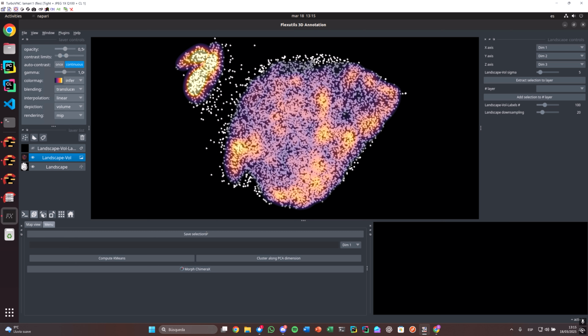Being the first one, the Save Selections button. As you will be seeing later on, by clicking on this button, we can save what we have been doing up to that point so that Scipion can register all the outputs for us.